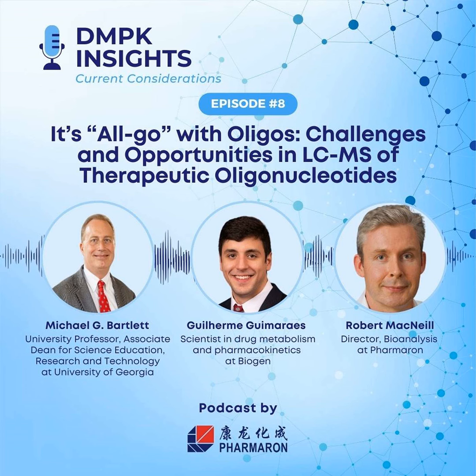I grew up as a triple quad quantitation person, and so it's almost heretical for me to even think that anything could be better than a triple quad for quantitation of molecules. But high resolution mass spectrometry does a pretty solid job of it. So again, I think it's going to be just like everything. It's going to be very dependent on your application. It's going to be very dependent on your molecule.